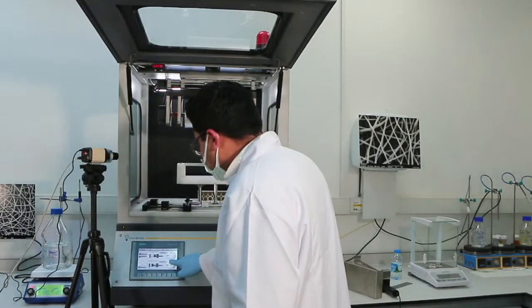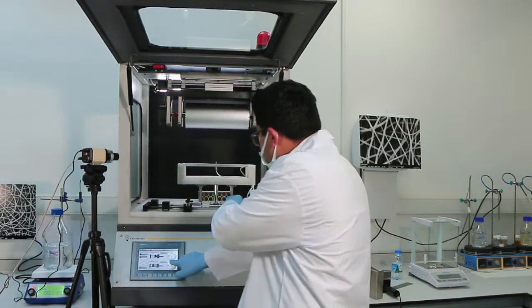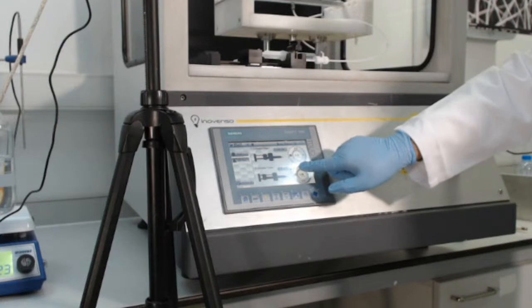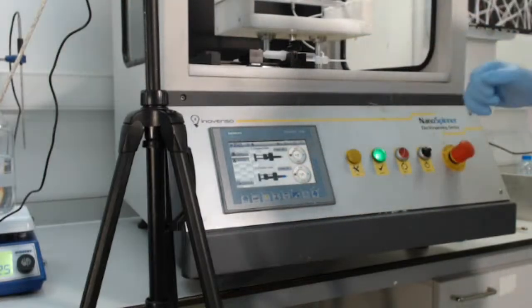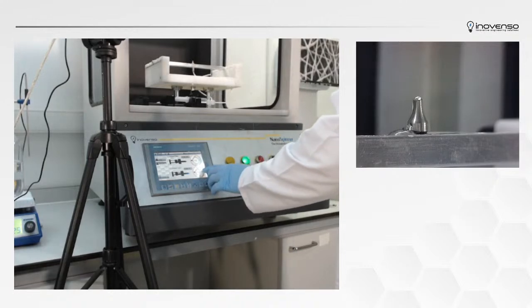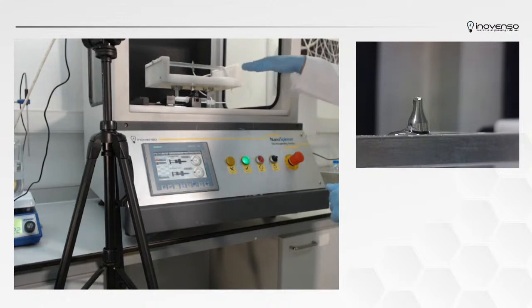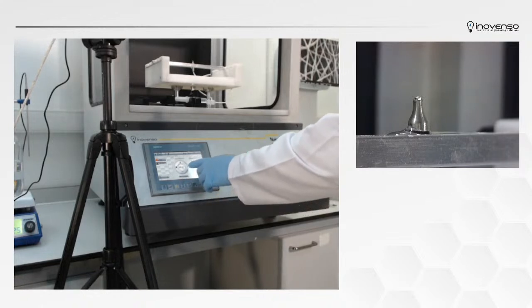To do that, I'm going to press this. Now the syringe pump is activated. It's pushing the solution all the way to the tip of the nozzle. Okay, now you can see it's leaking out at the tip. Great. Now let me start the flow rate. Now it's pushing out 5 milliliters per hour at a constant rate. Now we can apply high voltage to begin the spinning.